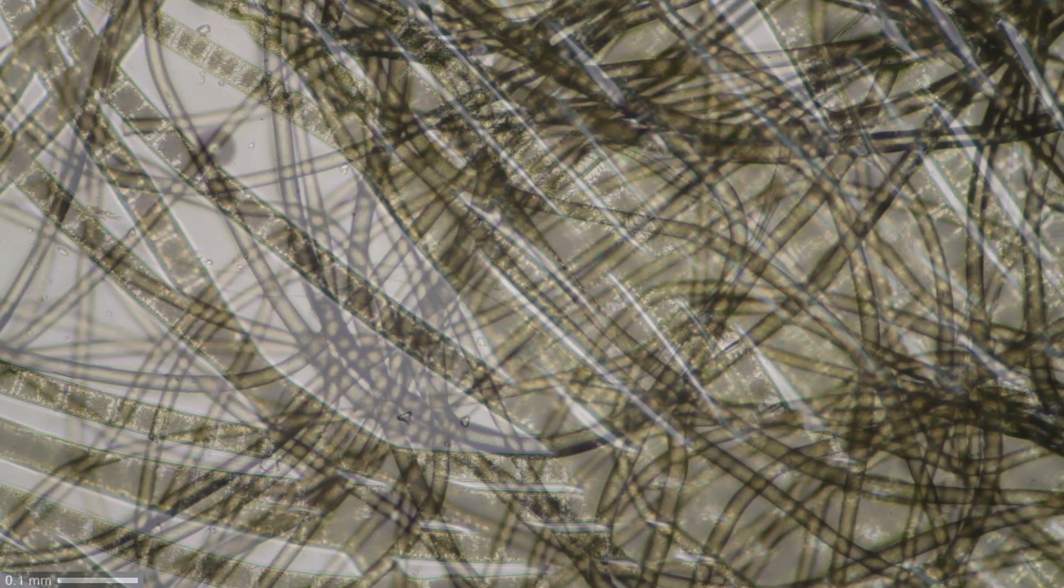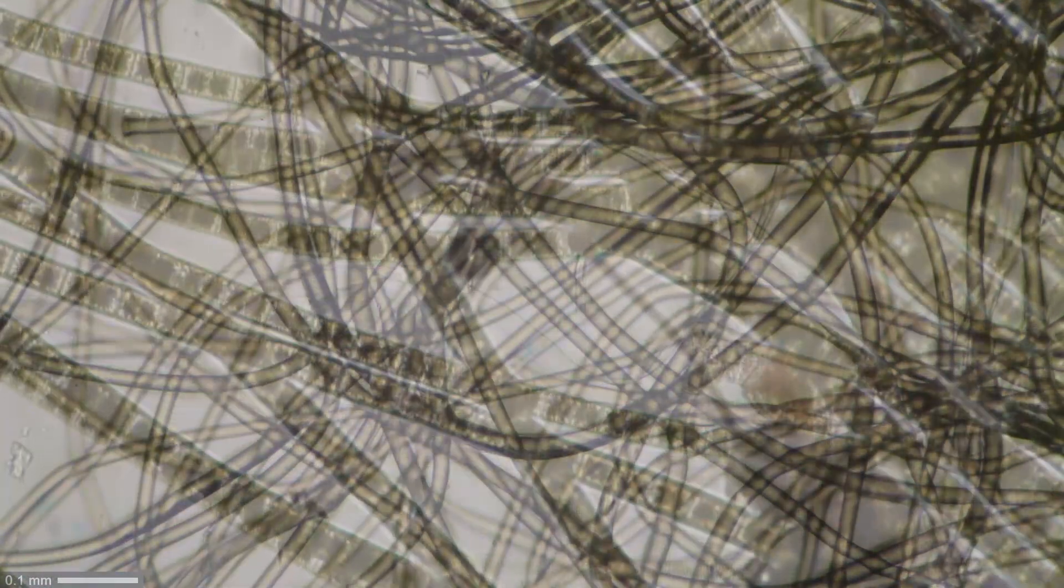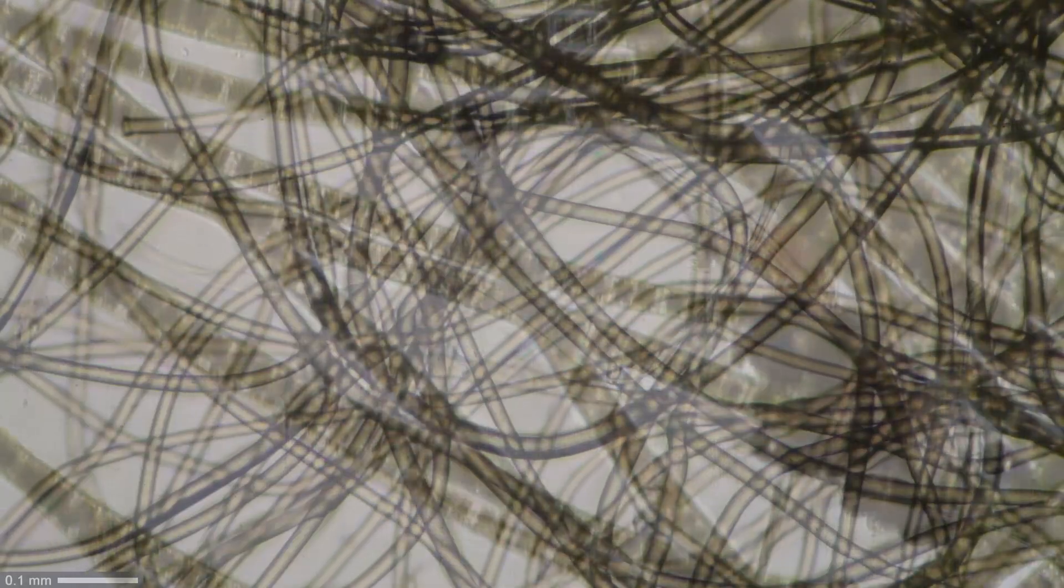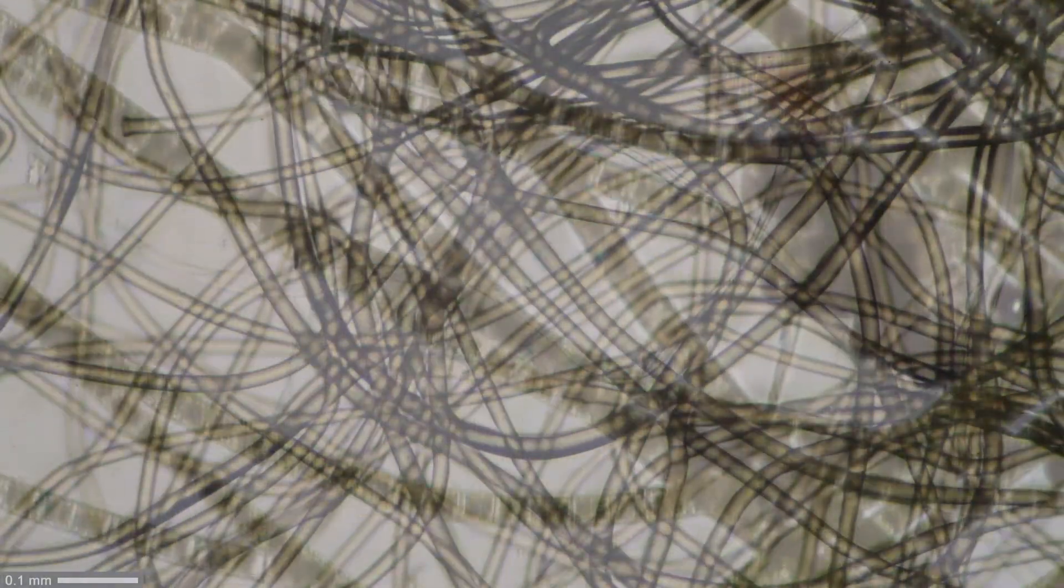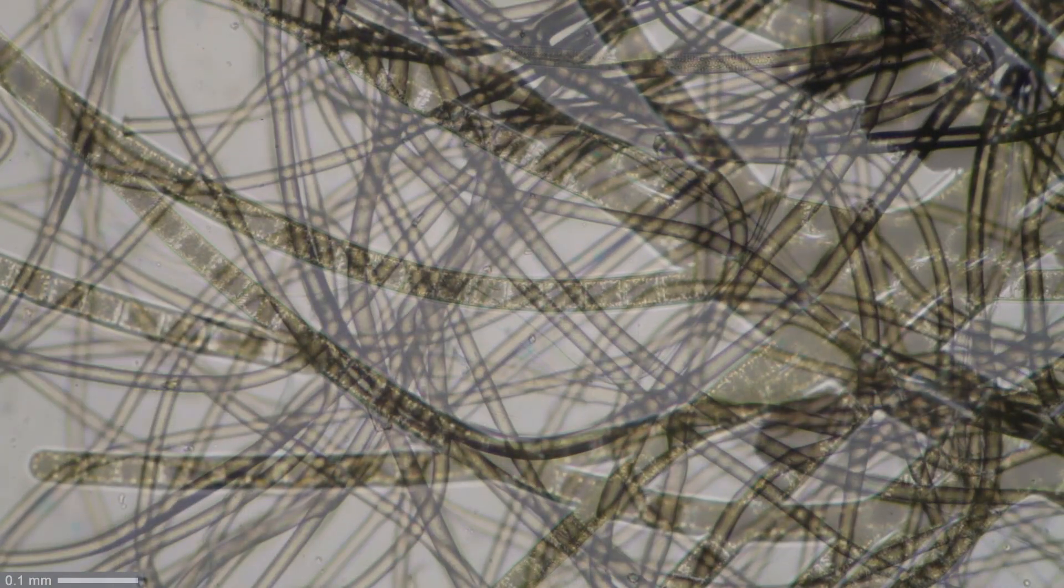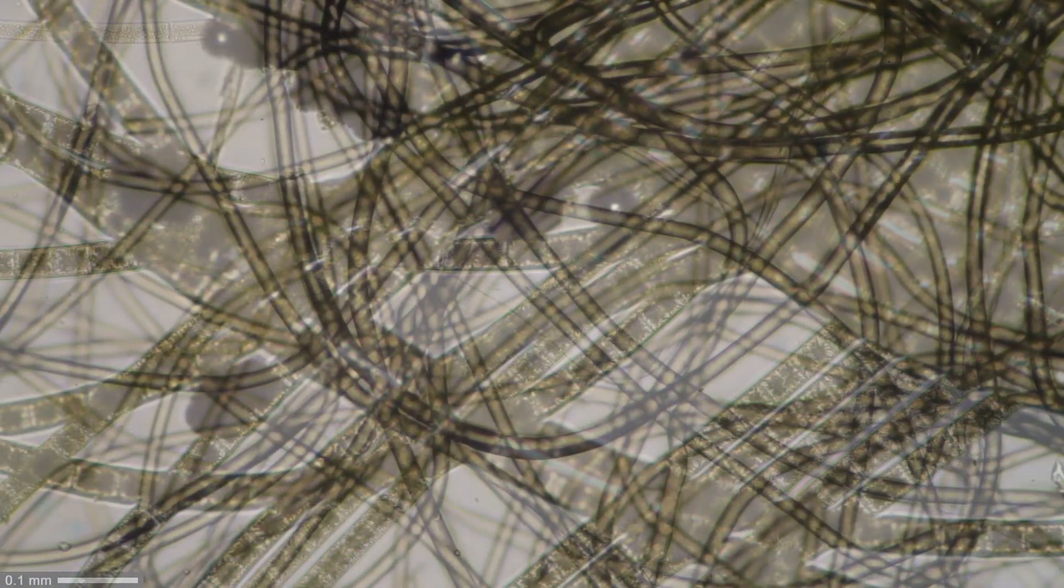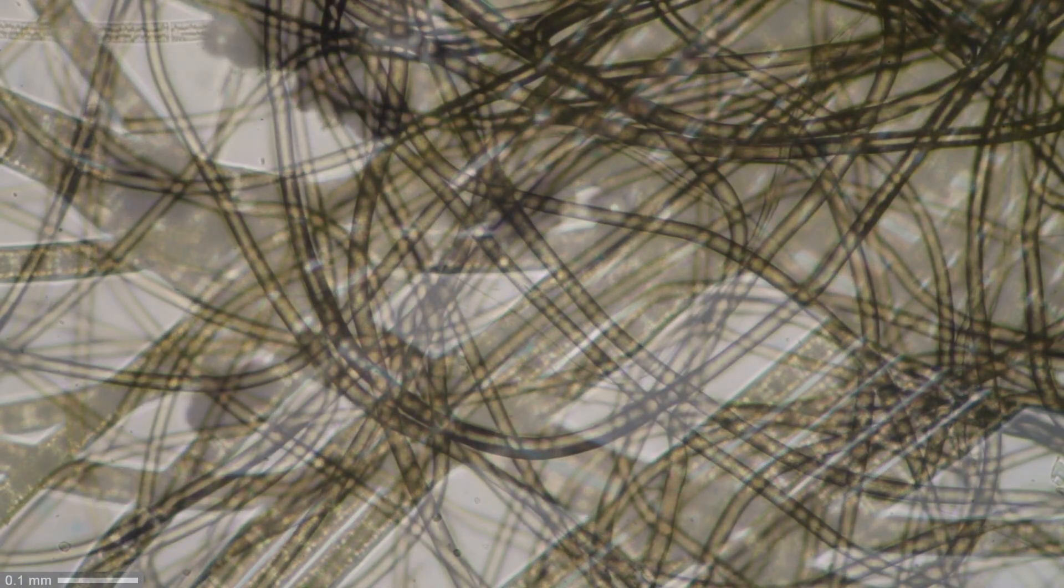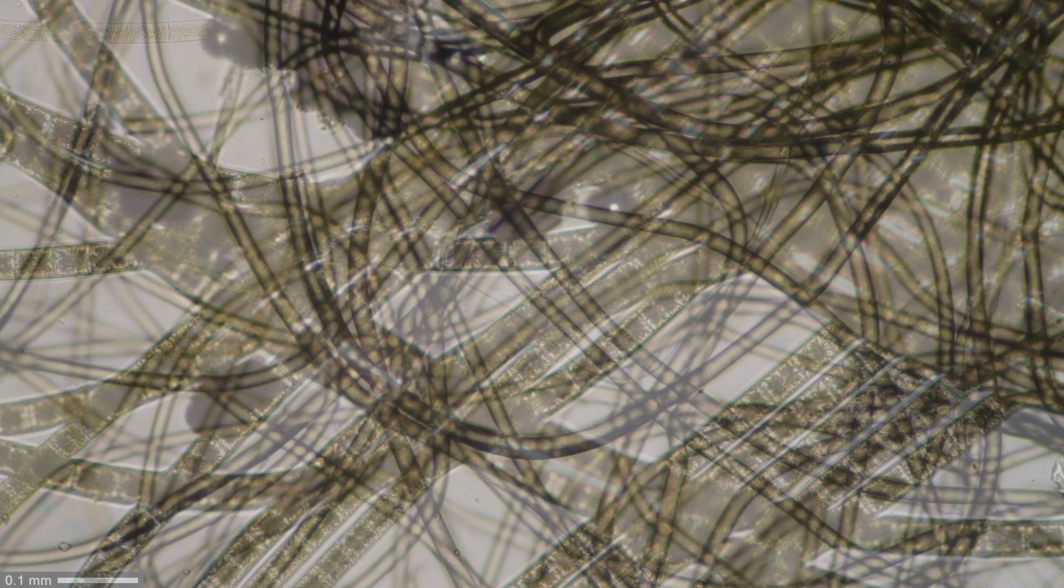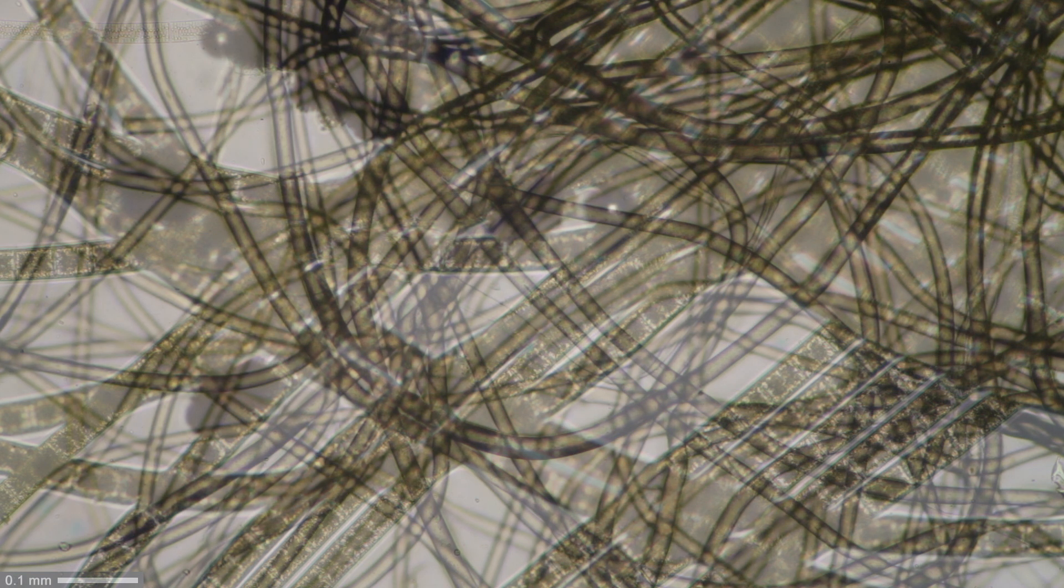I'm going to superimpose two images, so it looks a little bit messy now. But what you see is you see the fibers in the background and on top. At the same magnification, you see algae. So the moving picture, these are the algae. And you can see that the fibers are actually significantly thinner than the algae. So basically, are we able to see individual cells? Well, maybe not the individual cells, but the thickness of the individual fibers, synthetic fibers, is actually thinner than the cells of algae. So that should kind of put everything a little bit into relation here.